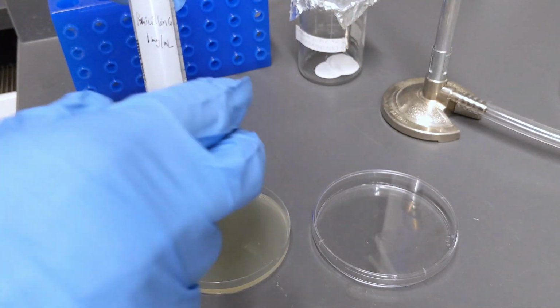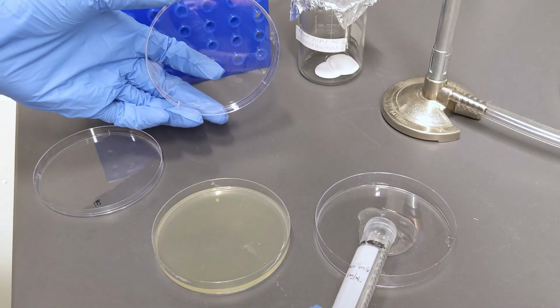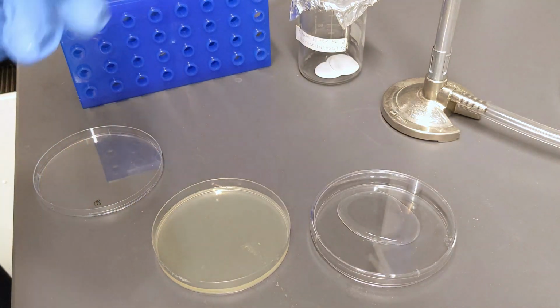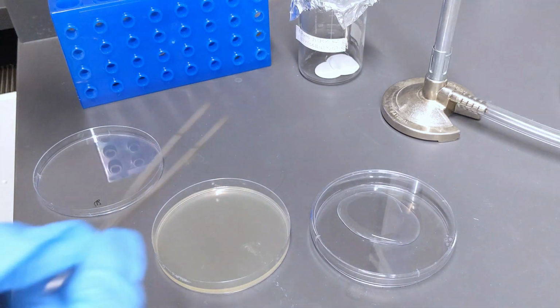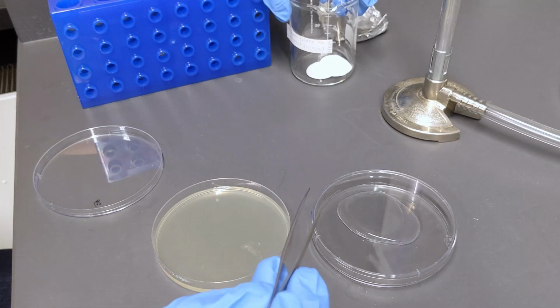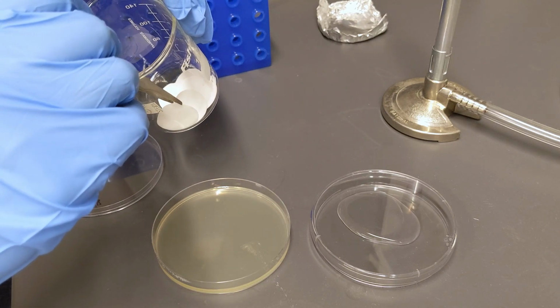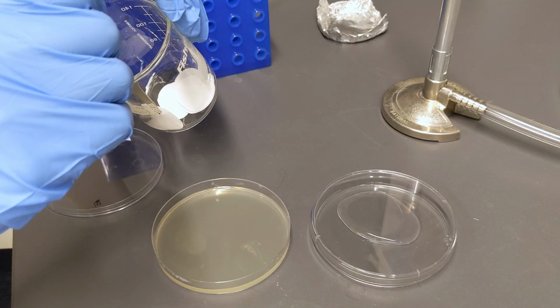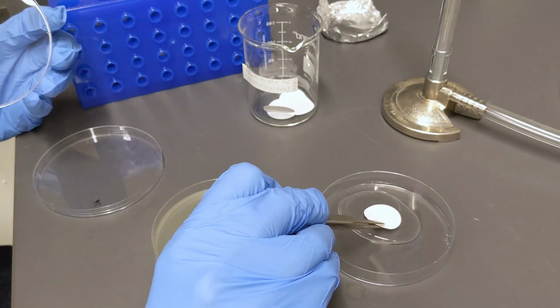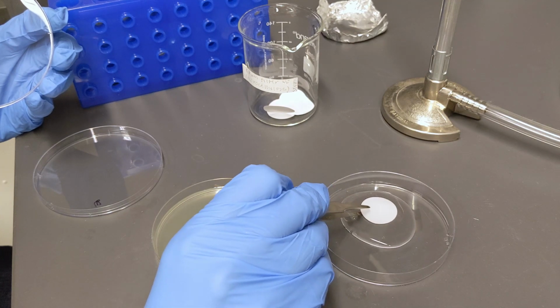Next, we prepare a penicillin solution. Here is the penicillin solution. And we're going to immerse the filter in the penicillin solution and place the filter on the agar plate.